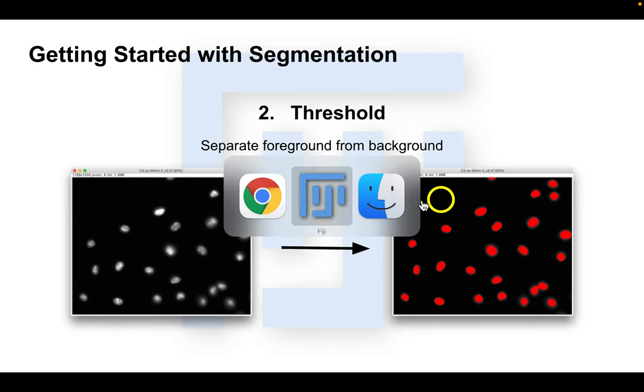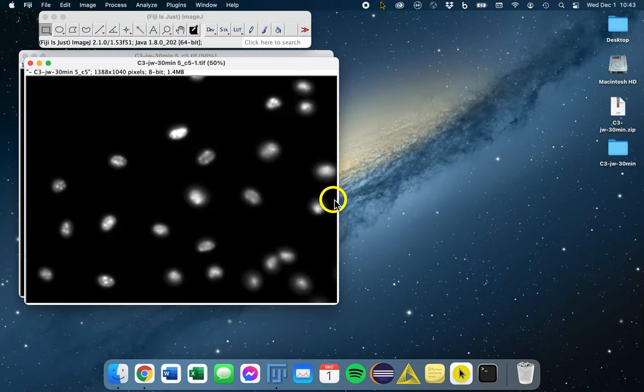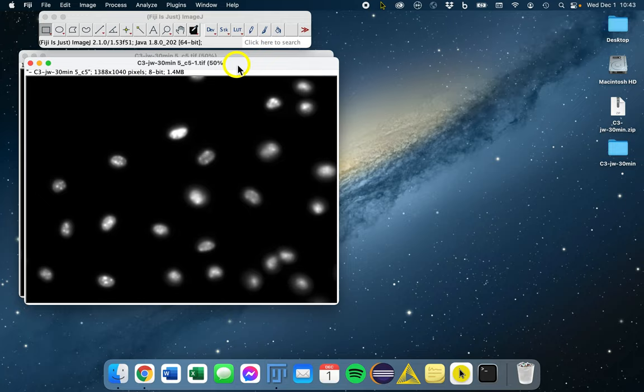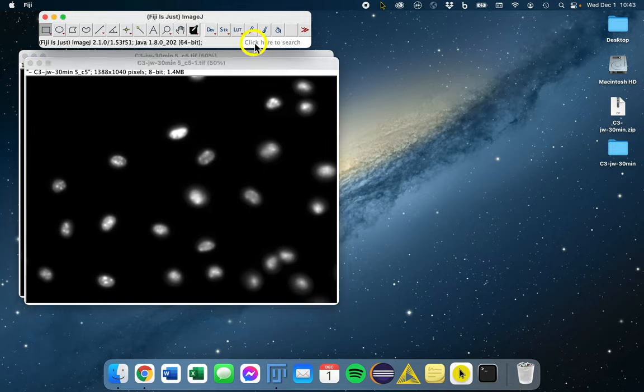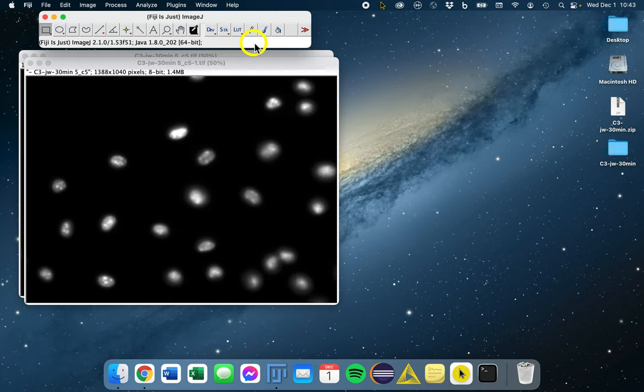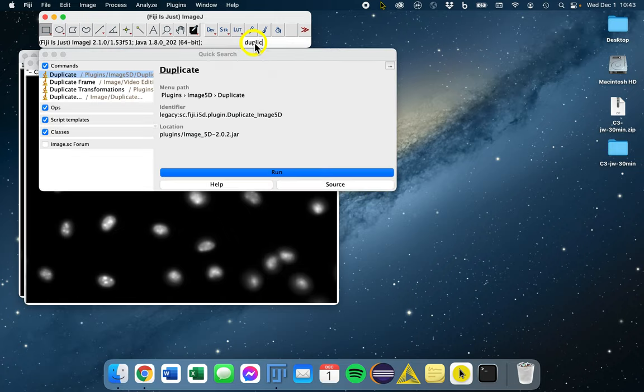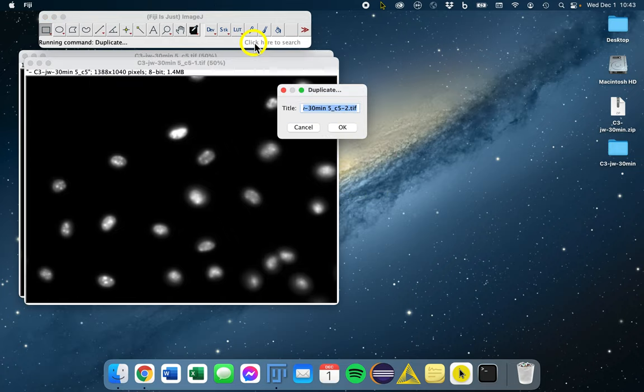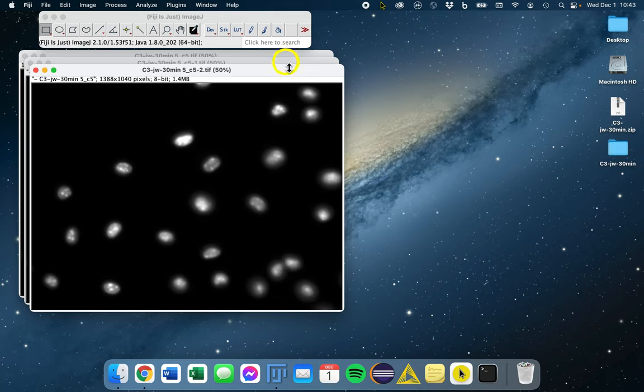So let's switch back to Fiji. This is where we left off in our last step, the preprocessing step. This is our Gaussian filtered image. Now the first thing we'll do again is duplicate this image and then work on the duplicate.